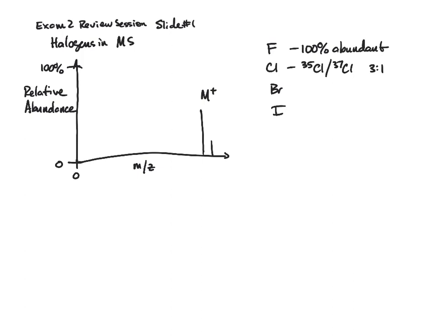So you'll learn about radicals at some point in this semester. The other thing it does not detect are called carbenes, which are also neutral. So the parent is the ion that has all the elements in the molecular formula.